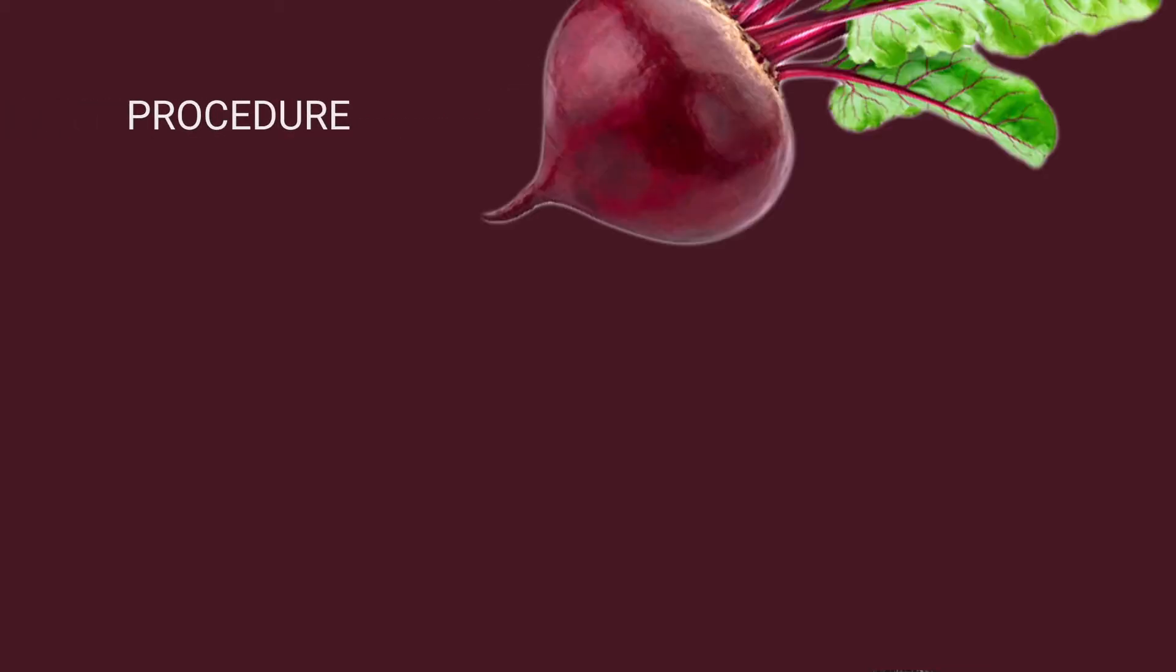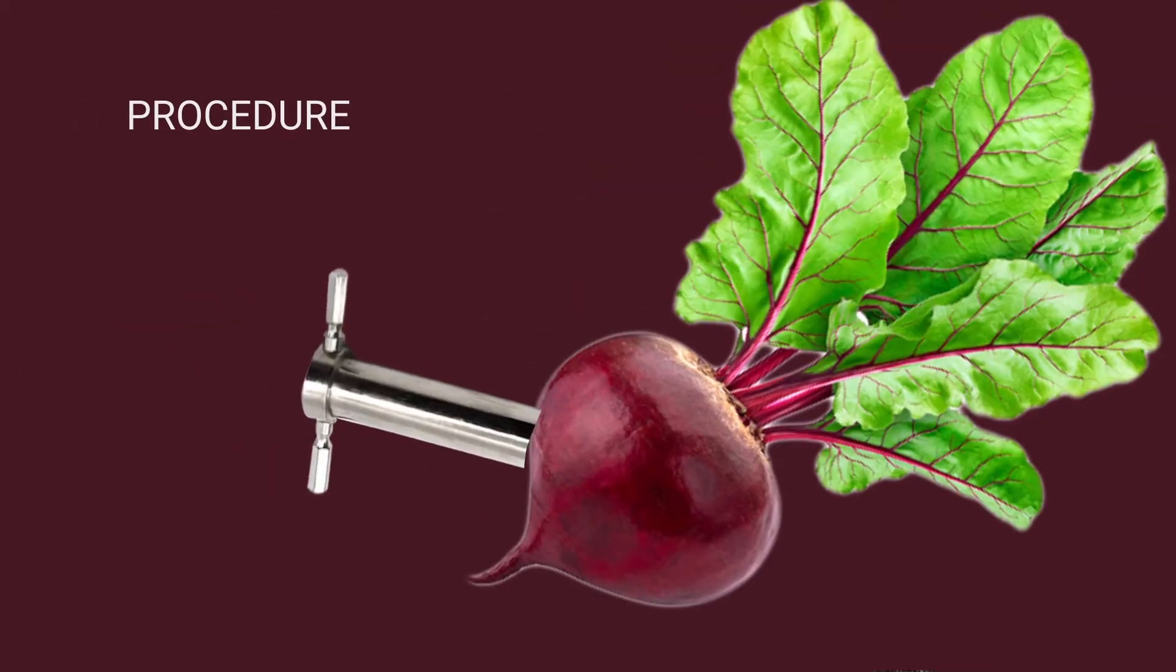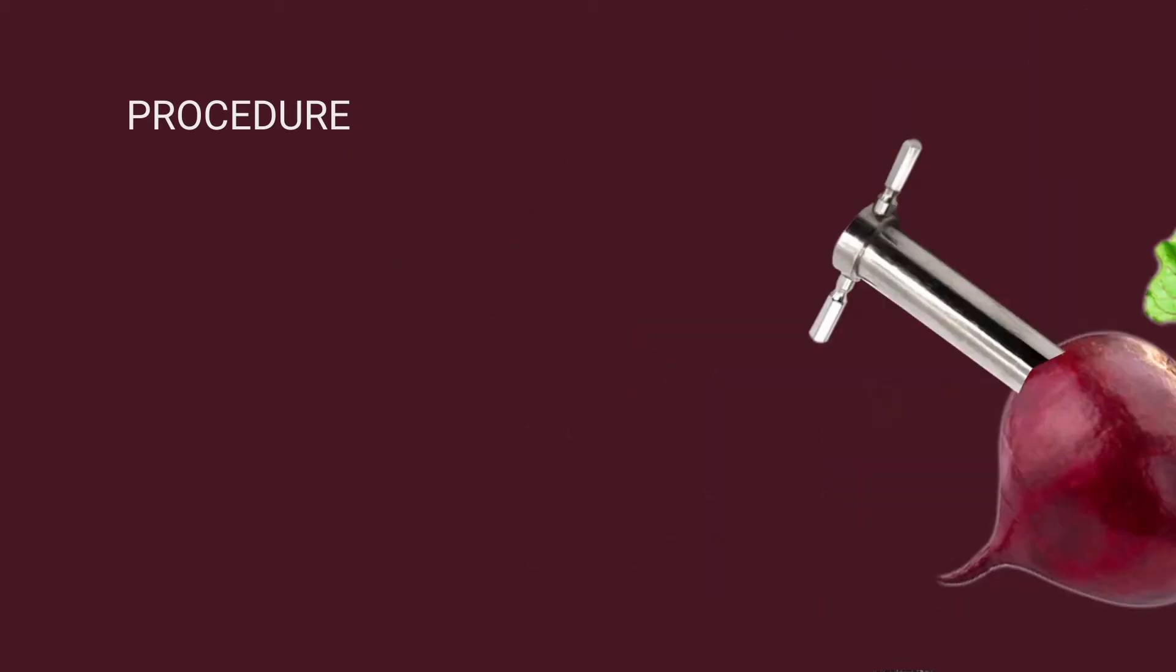Procedure: Small equal-sized pieces of beetroot tissue are cut with the help of a cork pourer and thoroughly washed with distilled water.